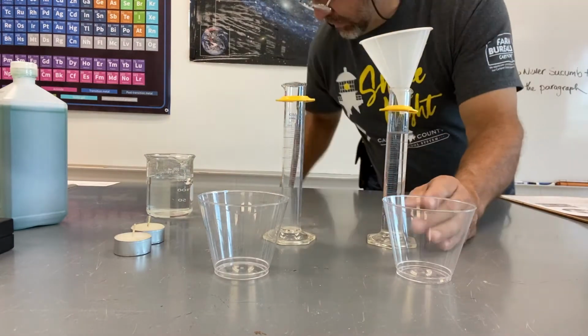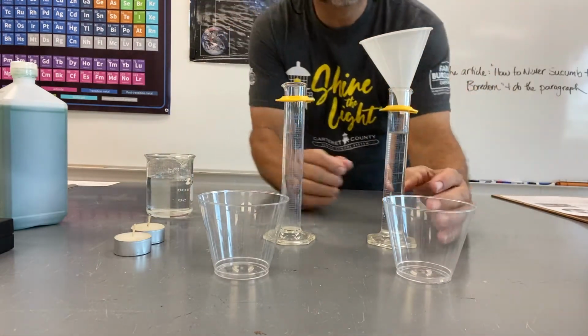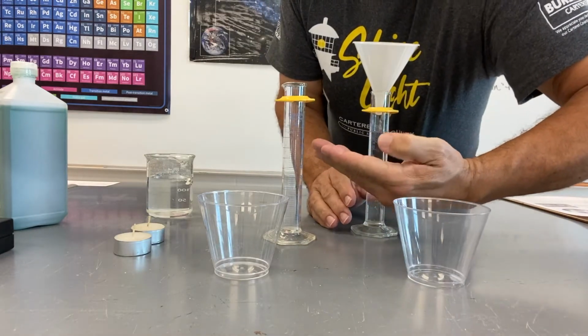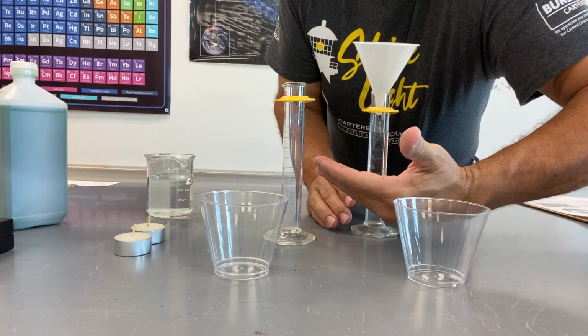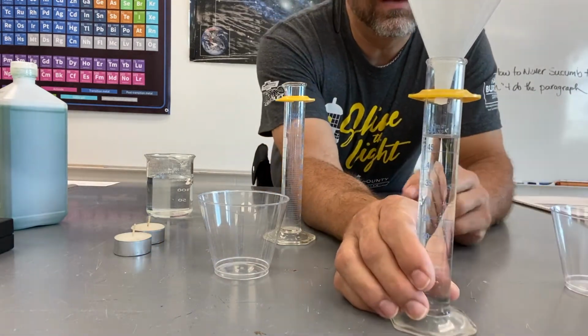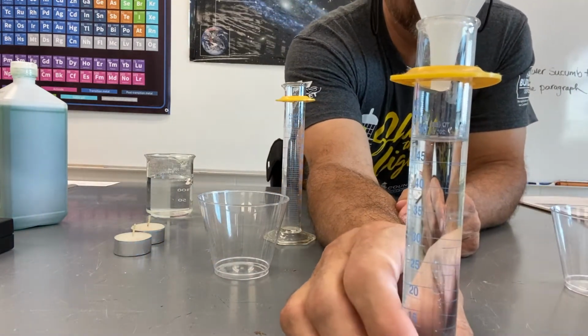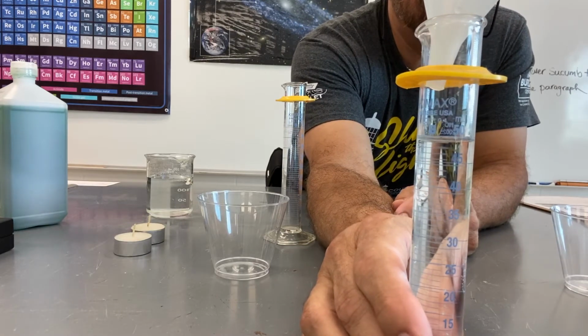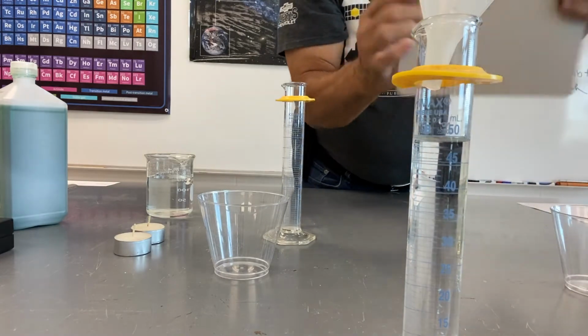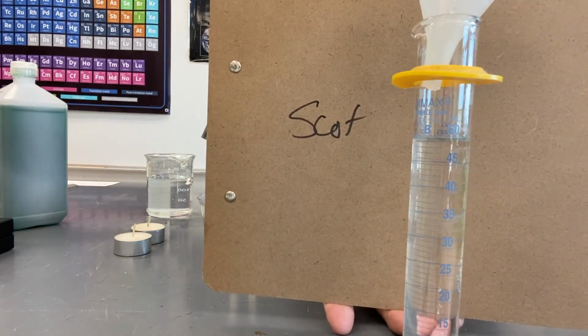So when you're using one of these, because it's a cylinder shape, there's a curve to it. So it's actually kind of bowed, like my hand is bowed right now. You can see there's a little bit of a curve there. That's called a meniscus. And you want to mark the level of the water at the lowest point of the meniscus here. Let me see if I can get something behind it so you can see it.